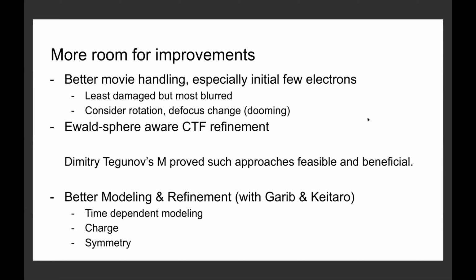And we are also working with Garib and Keitaro Yamashita at LMB on better modeling and refinement of high resolution structures. This includes time-dependent modeling of, for example, radiation damage, or modeling different maps simultaneously to follow time-dependent evolution of conformational changes, for example from time-resolved stopped-flow or quench-freeze experiments. We are also interested in modeling charge and better visualizing hydrogens, and we are also working to better model symmetries.